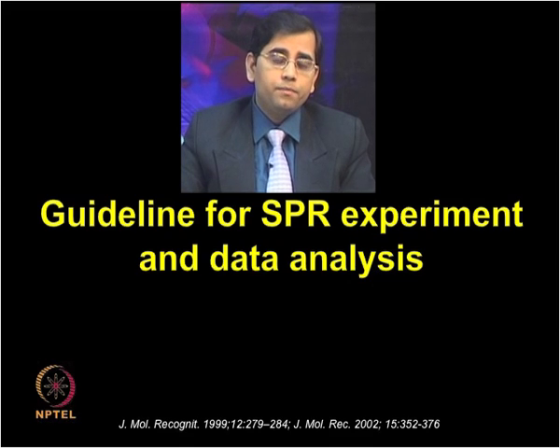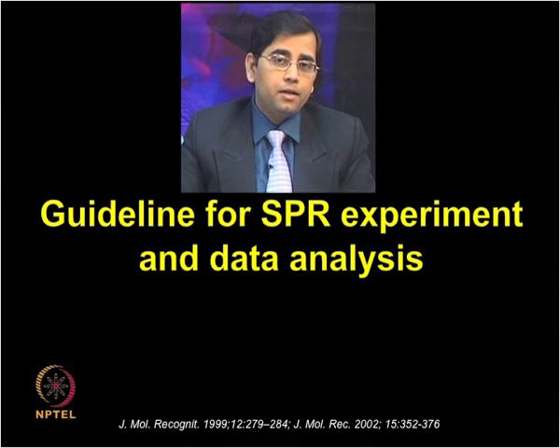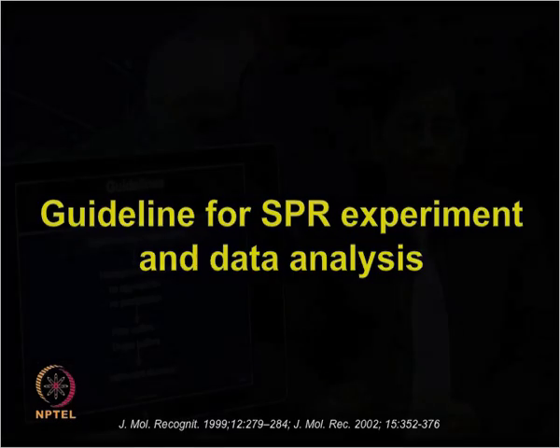Performing a good SPR experiment, data collection and processing can eliminate many artifacts and provide good quality data. I will briefly describe some of the guidelines, but for detailed description and more information you should read these references.